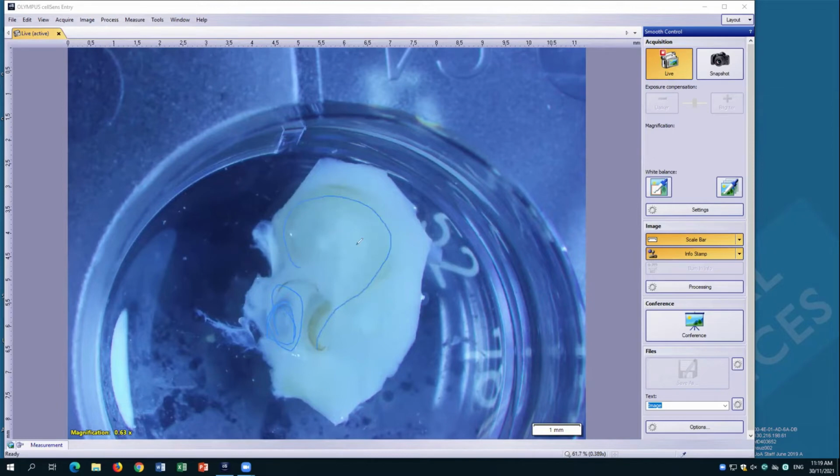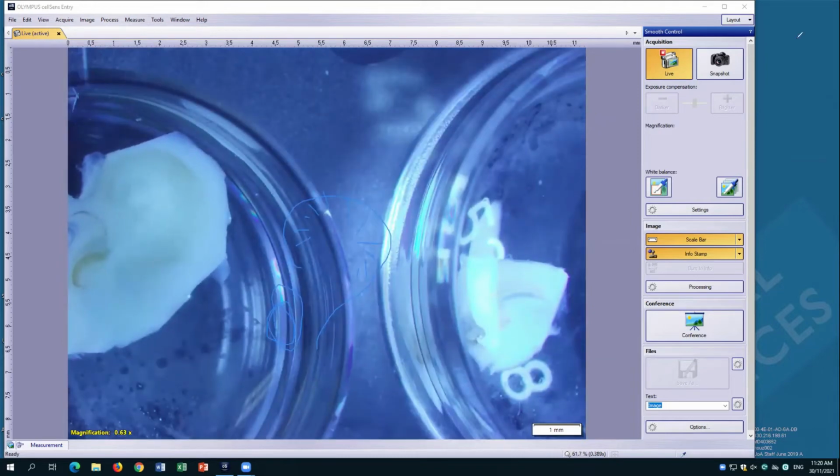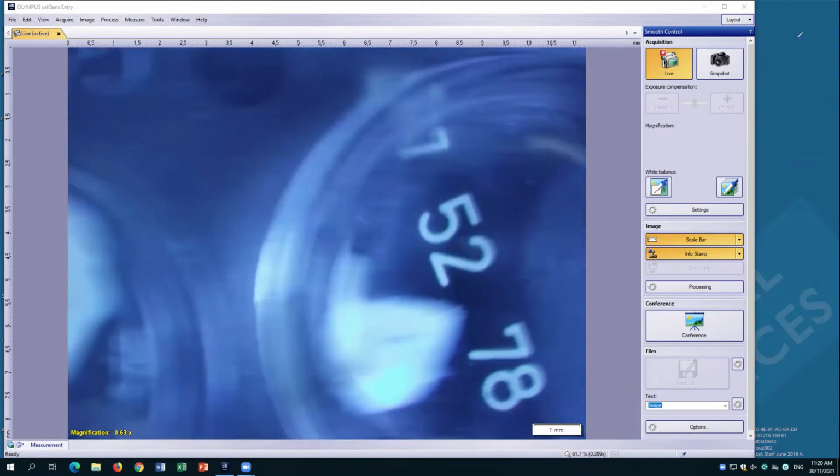If you look really, really closely, you might also see these radiating nerve fibers coming from the modiolus towards the outer end of the cochlea. So again, from a tissue biologist's point of view, the cochlea is a beautiful structure. It's so complicated and very hard to dissect. I think it's a biological beauty.